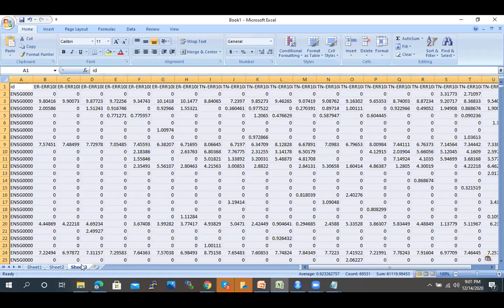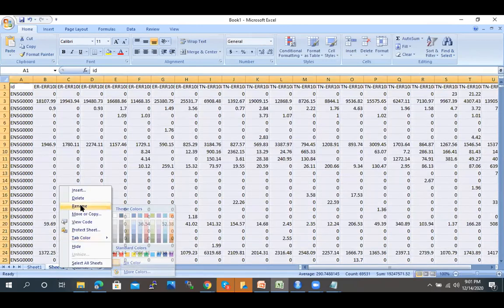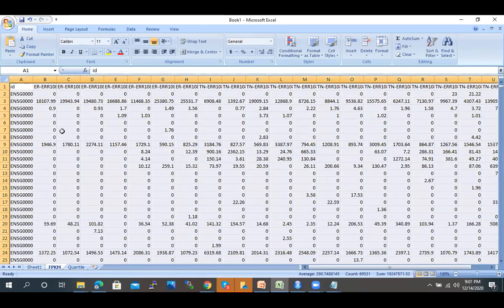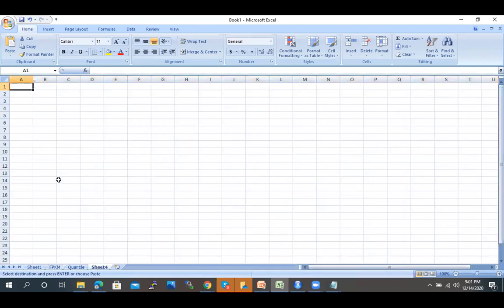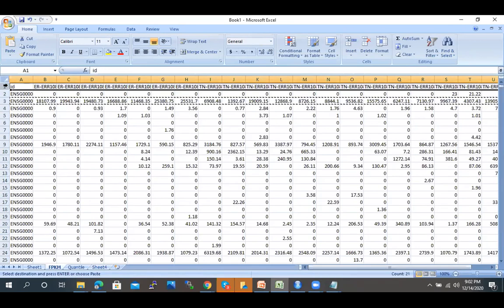Now I can check what the difference is after the quantile normalization. So this was my normalized data. You can refresh it as well to check whether your pipeline got completed or not. This is quantile normalization. This is FPKM values. Here I'm taking this particular one to compare the effect of quantile normalization. I'm taking this second chain, which is with the raw values, and I'm taking gene ID.